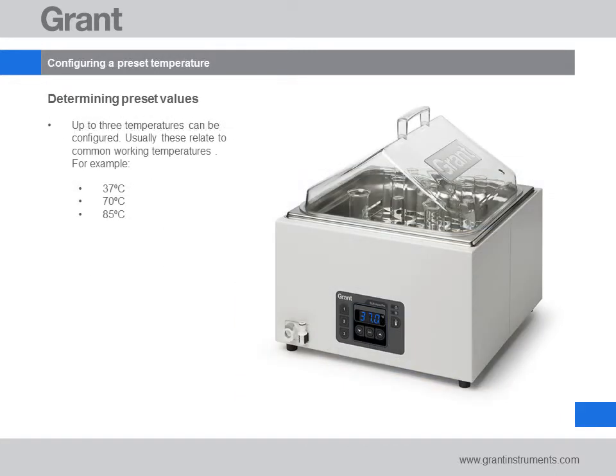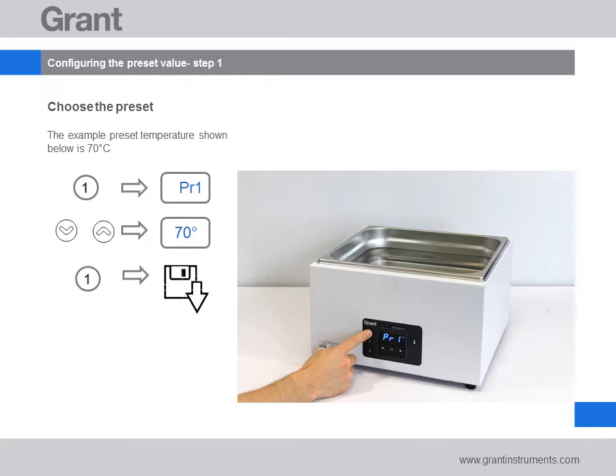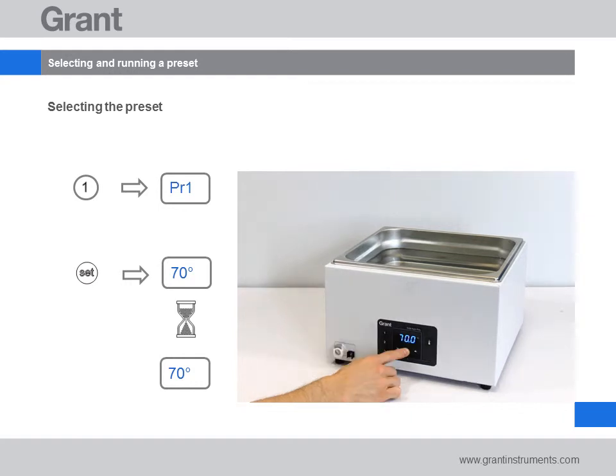The last feature we'll look at is temperature presets. If you regularly perform experiments at the same temperature, a preset can be used to quickly set the temperature. Press the preset you want — there are three, numbered 1 to 3. Our example uses preset 1. The display will briefly show 'PR1' and then the current preset value; the default is 10 degrees C. Use the arrow buttons to change the temperature to the one you want. Press the preset to save the value. To select and run a preset, press the preset number key you want and then press set. The bath will now heat to the temperature value.